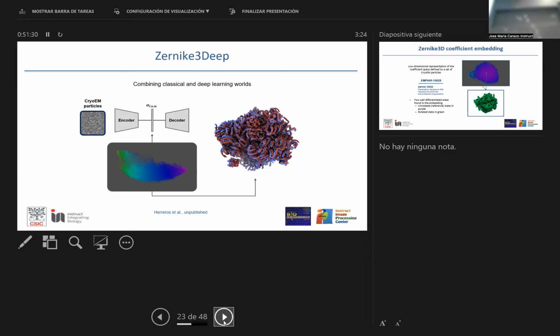Completely. The whole field should be aware that one experiment may have many variables that you do not control, or that you do not know you should control. For instance, with the spike, something probably obvious that we didn't think of: temperature. We have much more flexibility when you were holding the tube at 36 than when it was at 4.